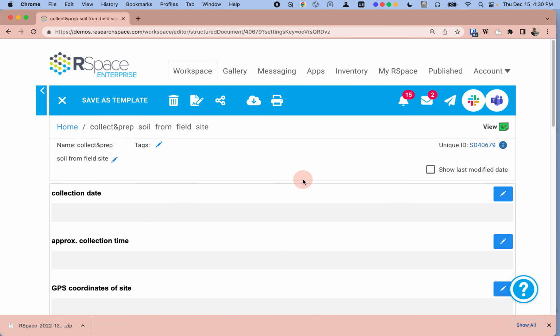But what if you're in a situation where you don't have access to the internet, and so you can't fill in this detail in real time? You'd have to muck around using some intermediate where you'd record it on paper, or perhaps to a Word file somehow, and then transport it back to you, and then if you're lucky you'll be able to maybe add the metadata back in manually.